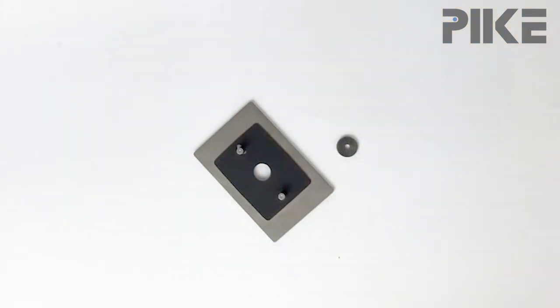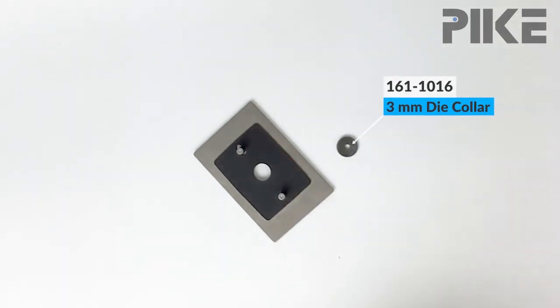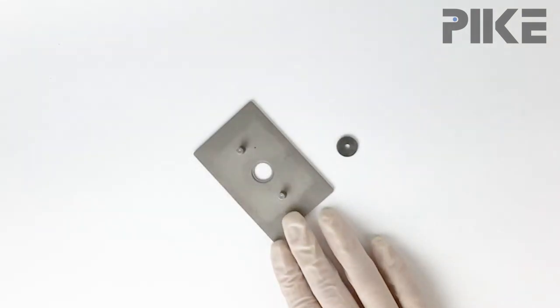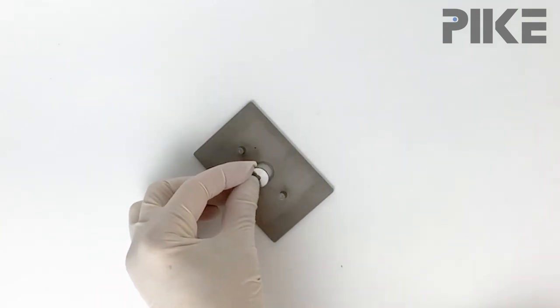To make our new film holder, we're going to start with the magnetic pellet and film holder. We're also going to use a three millimeter die collar that's typically sold with our three millimeter KBr die, but we're going to repurpose it today. First, remove the magnetic cover, and then go ahead and place the die collar right in the recess.